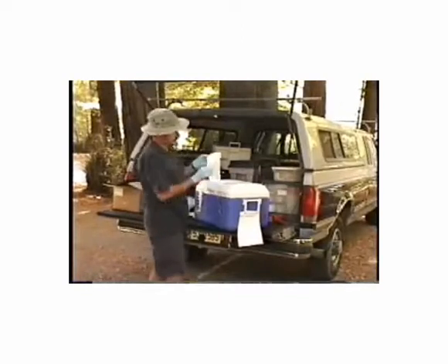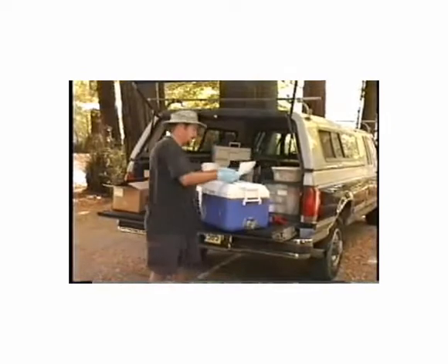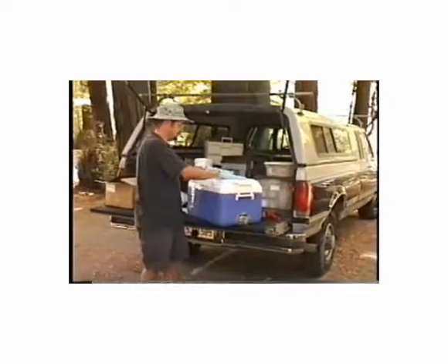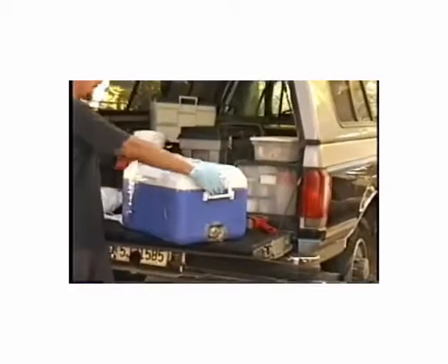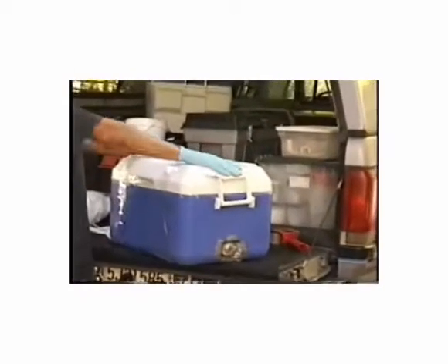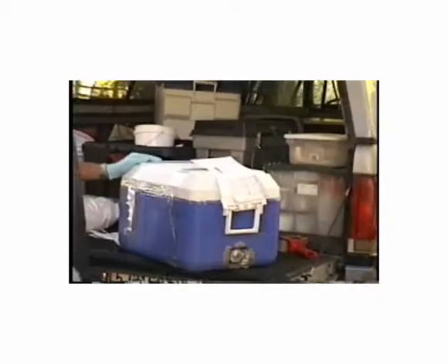And then stick the shipping label onto the label holder, making sure it's secured, making sure your addresses are all filled out, everything's filled out as should be on the shipping label, and you're ready for shipping.